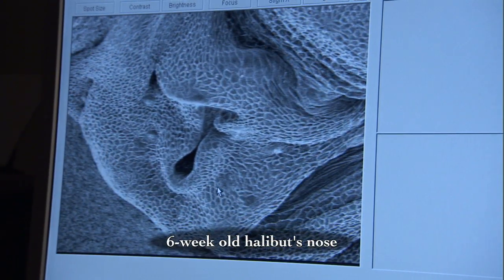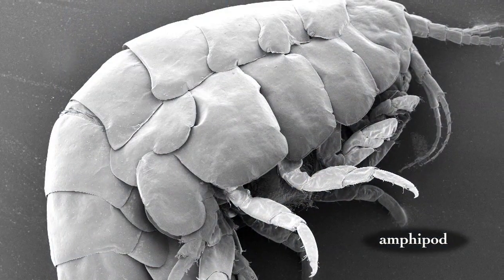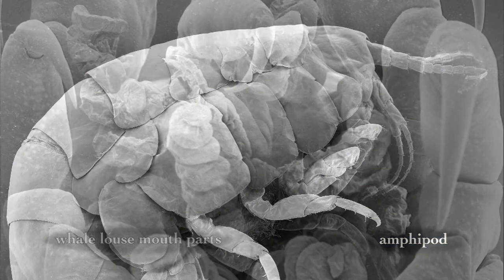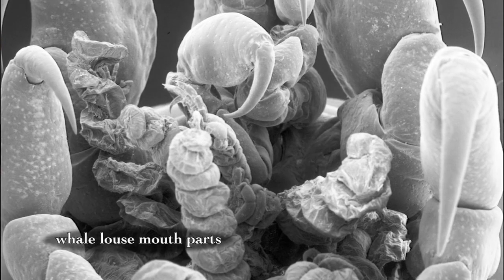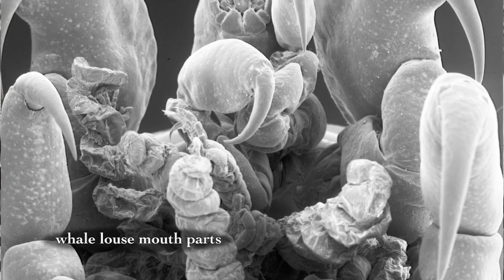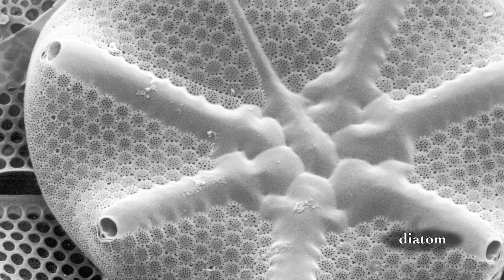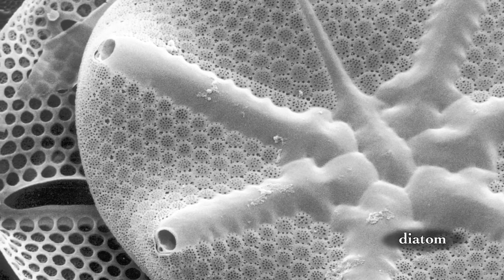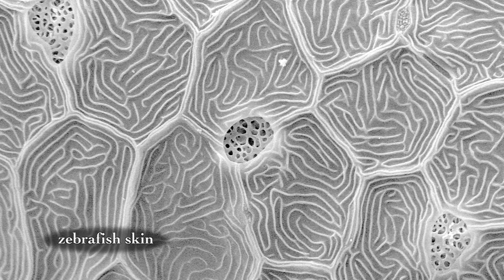This one is a scanning electron microscope, so it scans over the surface of the tissue or whatever we want to look at, so that we can see all of the surface features. You can't see through it, but you can see the really cool patterns at a very high magnification, much more so than with a light microscope.